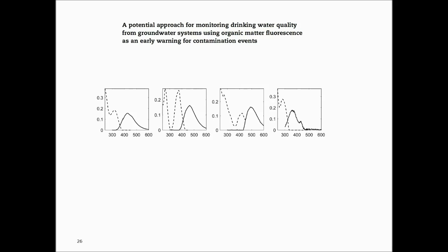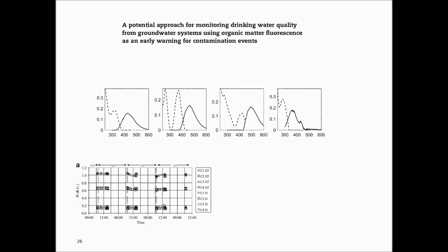In their study, the researchers have found a 4-component model which did not have a significant amount of variability on a temporal scale. This is what you can see in the bottom left figure here. All of the components seemed rather stable with regards to long-term variability over an amount of weeks to months, but also in terms of their time of day.